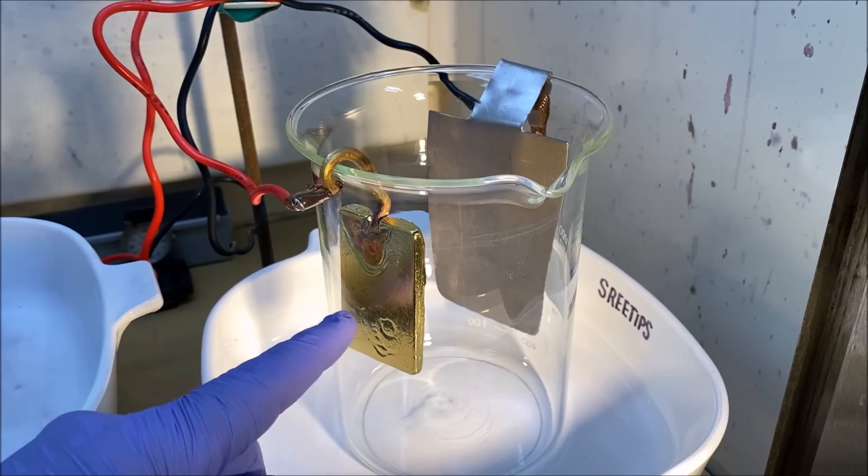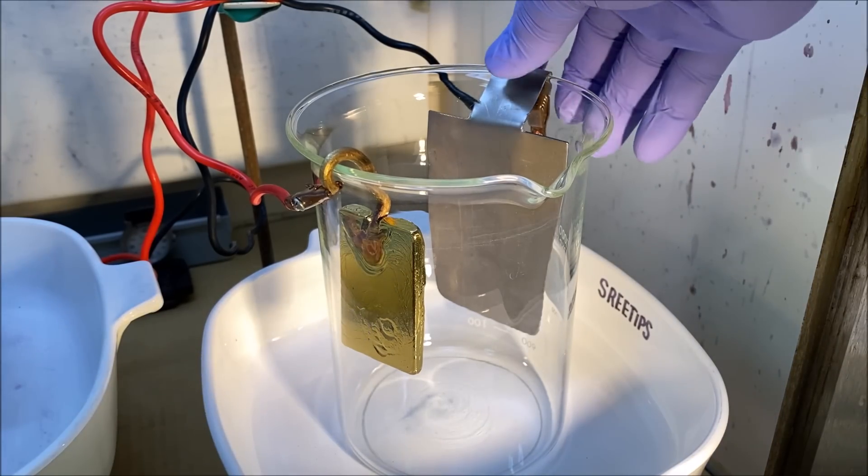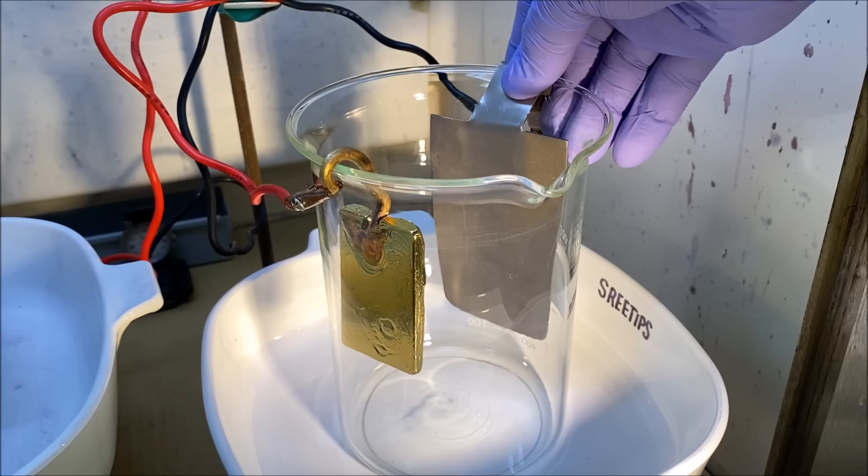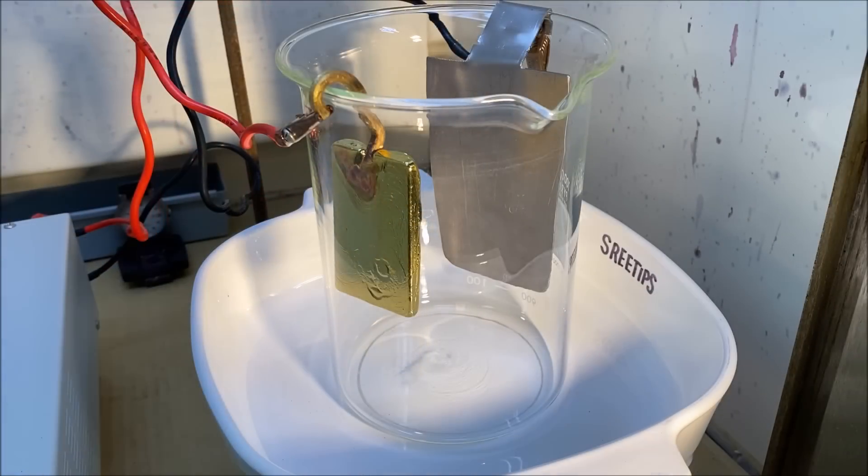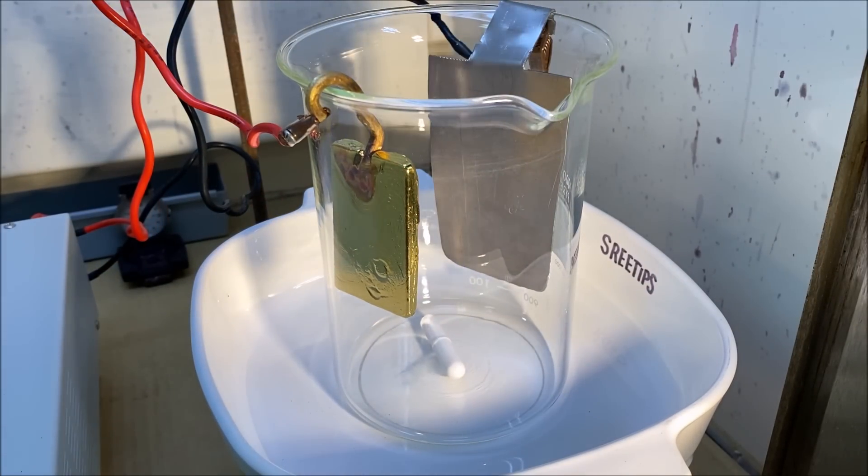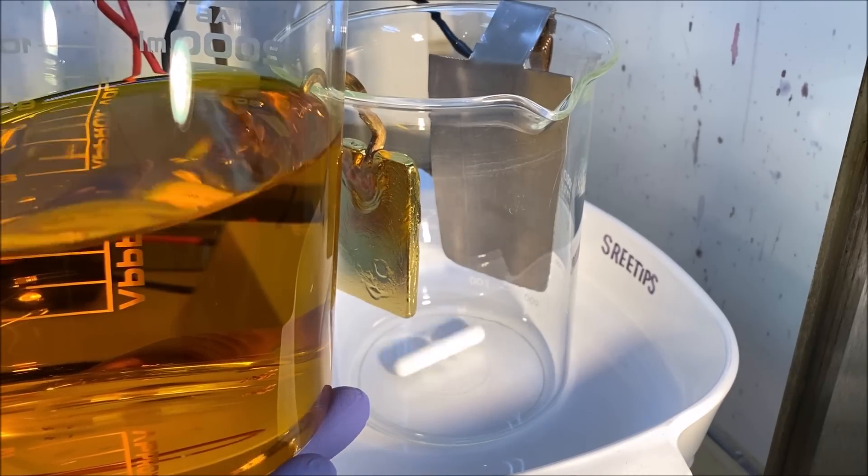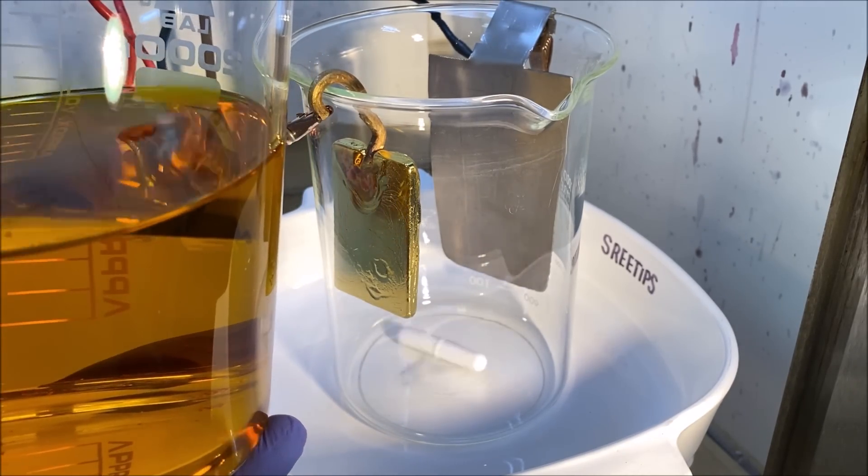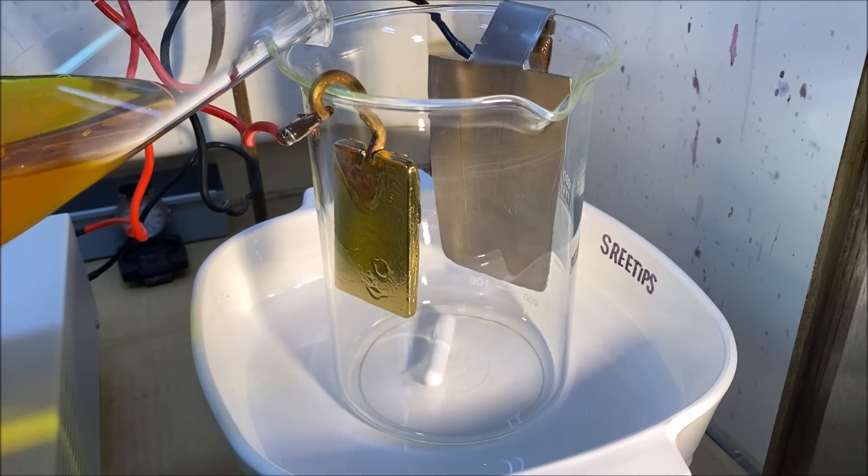I've got the anode bar connected to the positive side of the power supply and the titanium cathode connected to the negative side. Let's add a stir bar in here and make sure it's going to spin free. Now I'll add the electrolyte. This is the electrolyte from the pure gold that we dissolved with hydrochloric acid and hydrogen peroxide.